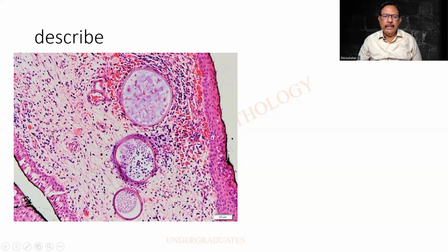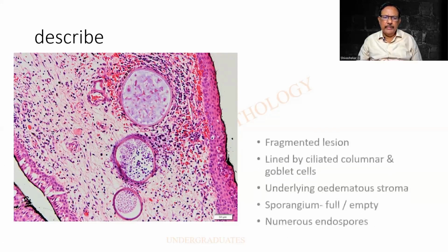This is the subepithelial stroma. It is looking edematous. Look, the cells are all getting separated, therefore I call edema. But more important is there are some well circumscribed or circular lesions that I can make out. And same old friend of ours, these dark cells are all the inflammatory cells, the lymphocytes.